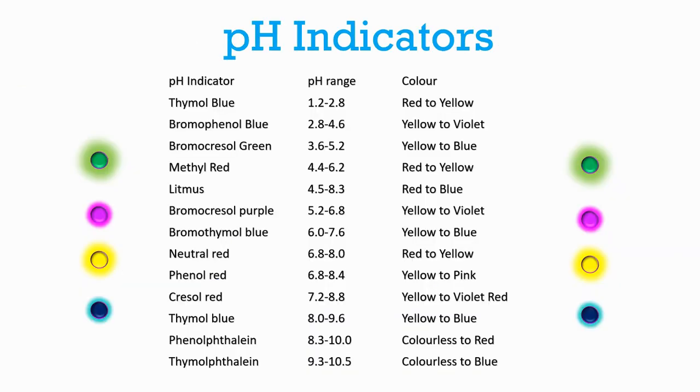One common agent in differential media is the pH indicator that changes color when the pH of the medium changes. Bacterial growth can change color of media by two means. One is fermentation that produces acid and changes the pH to the acidic side. The other is utilization of proteins and production of amines that changes the pH to the alkaline side. Depending on the pH indicator used in the media, different colors are produced by the bacteria as shown in this table.